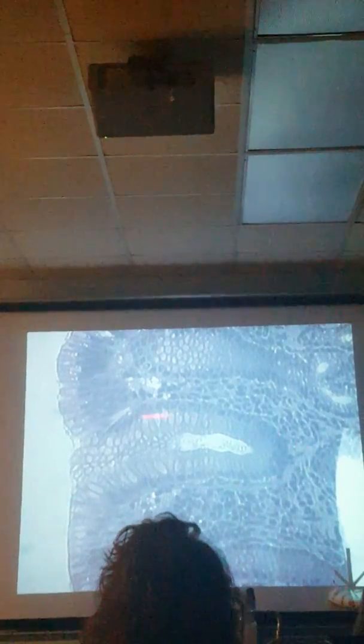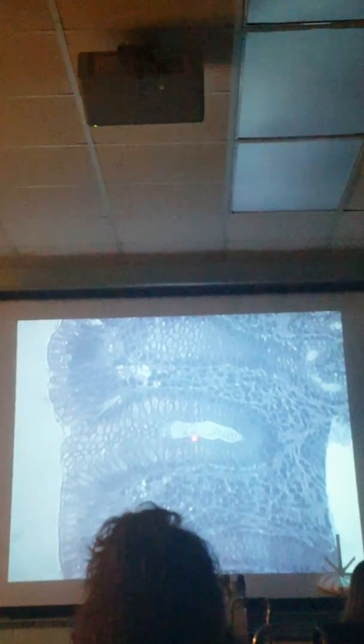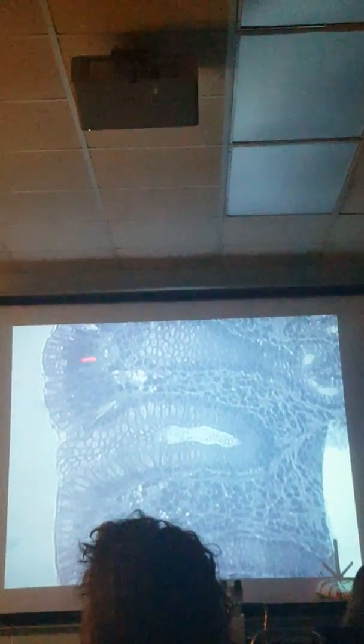There's folds in it, but you see how they're really long cells? And there's only one layer. So there's the nucleus, and there's the basement membrane. So that's a long single layer. So that's simple columnar, which is typical of the stomach and absorption.